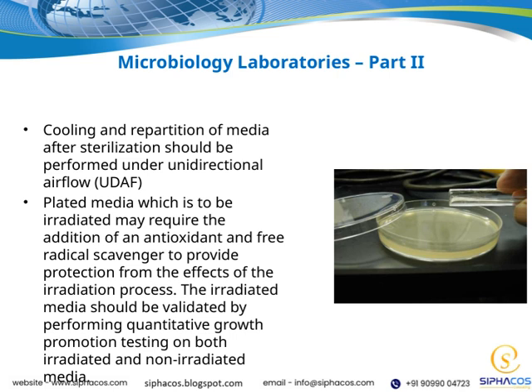After irradiation, it's important to validate the media. We do this by performing quantitative growth promotion testing on both irradiated and non-irradiated media. This step confirms that the media still supports microbial growth and meets quality standards after irradiation. All of these procedures are part of maintaining the integrity and reliability of microbiological media, which is a key component in ensuring accurate and reproducible testing results in our microbiology laboratories.